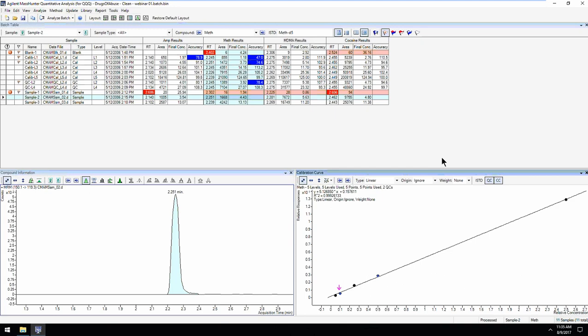Yeah. Lindsay, let's make a note of this. It's a very good question. Let us investigate this, and we'll get back to the user there and address that later. Yeah, absolutely. And if I didn't articulate that question properly, please ask us another, and we'll dig further either on this webinar or after the fact.